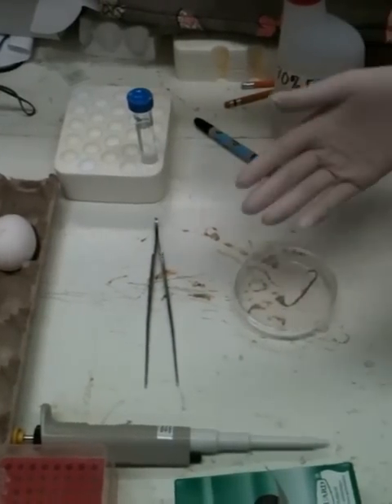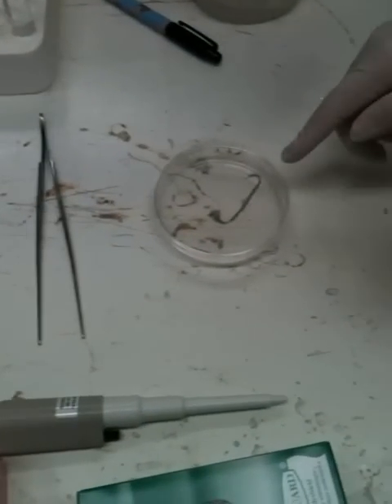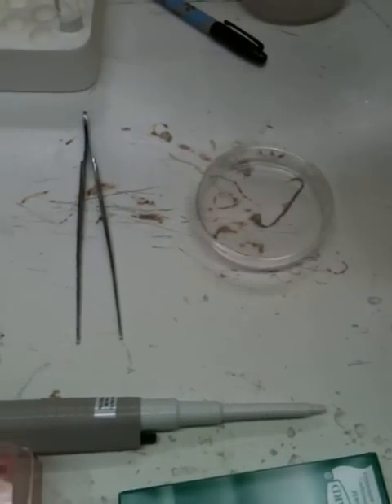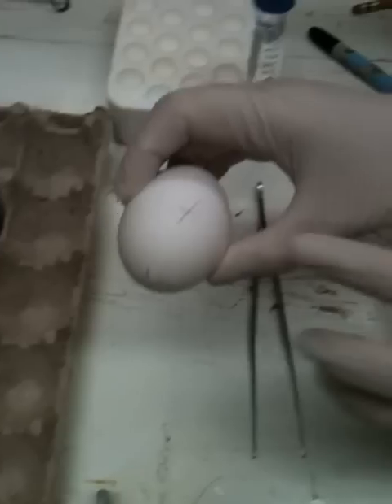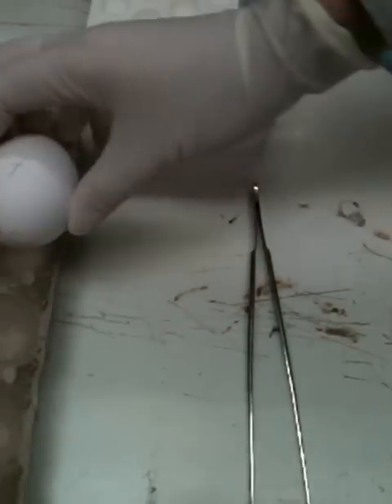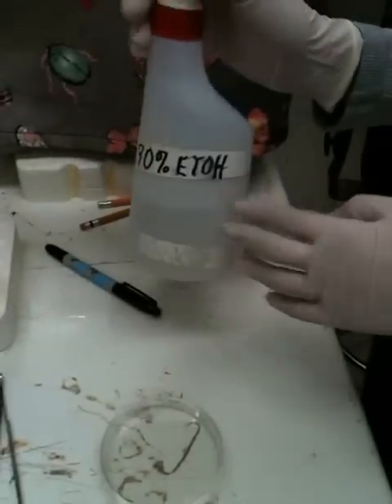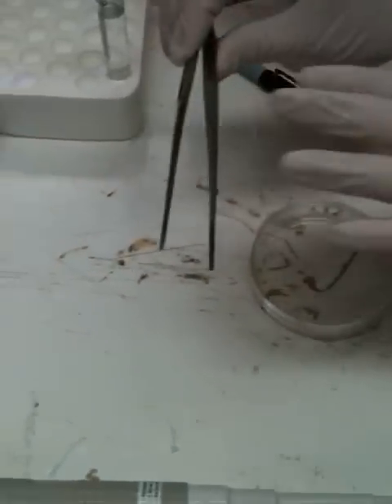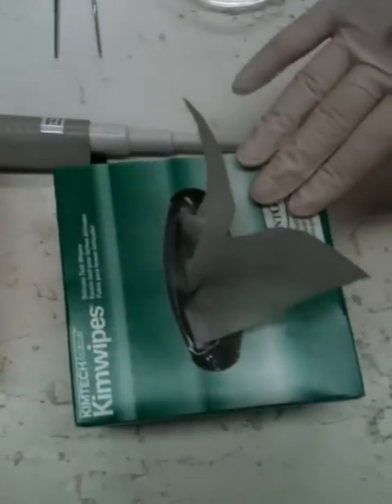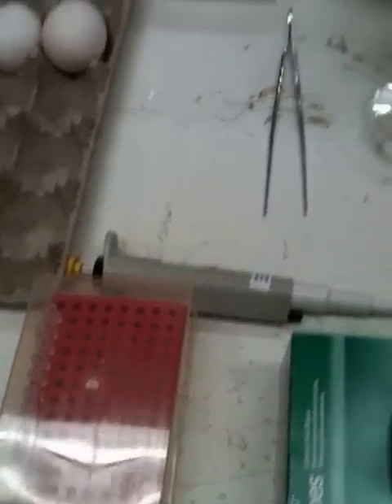This video will show you how to transfer the embryo from the egg into a tissue culture dish. What you need are fertilized eggs — the pencil mark shows the position of the embryo — 70% ethanol, a tissue culture dish, forceps, kimwipes, a pipette, and antibiotics.